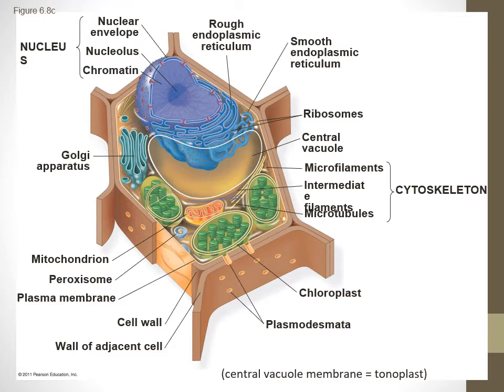And we're going to look at beet cells not because we are interested in beets for their own sake, but because beet cells contain a red pigment known as beta-cyanin. And when you damage their cells, that red pigment leaks out, so we can measure it. So if we are interested in asking a question like what kind of substances damage cell membranes, a beet is a good organism to test that on because it has cell membranes that are quite a bit like your membranes or any other organism's membranes. But in the case of a beet cell, you can actually easily tell when they've been damaged because red stuff leaks out. So that's why we use a beet as a model organism.